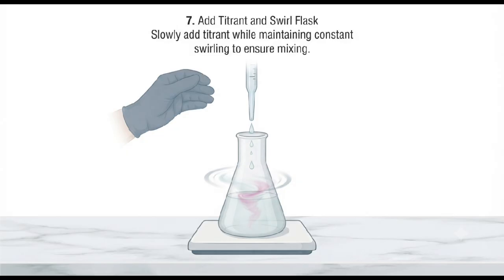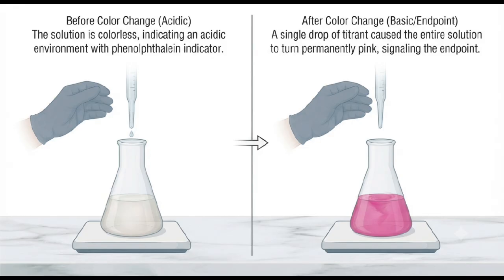Performing titration. Start adding the titrant while continuously swirling the flask. As the endpoint approaches, add the titrant slowly, often dropwise. Observe the solution carefully and stop when the specified endpoint change is reached. Endpoint. The endpoint is the point at which the indicator produces the required observable change. For example, in some acid-base titrations, a specific color change indicates that the endpoint has been reached.